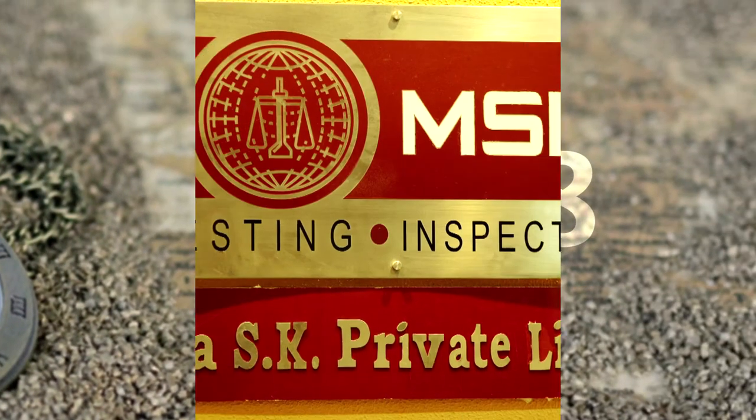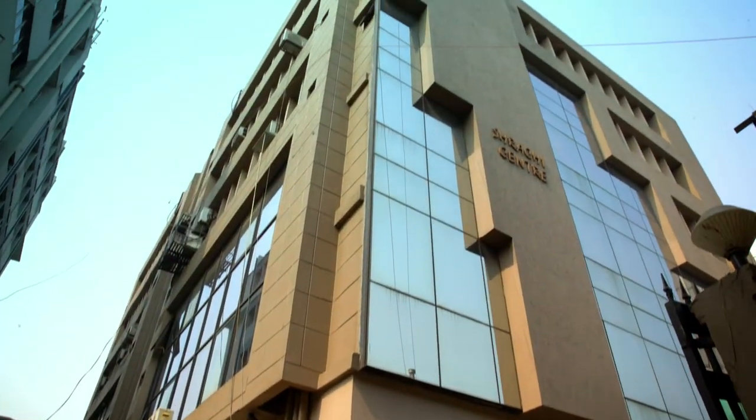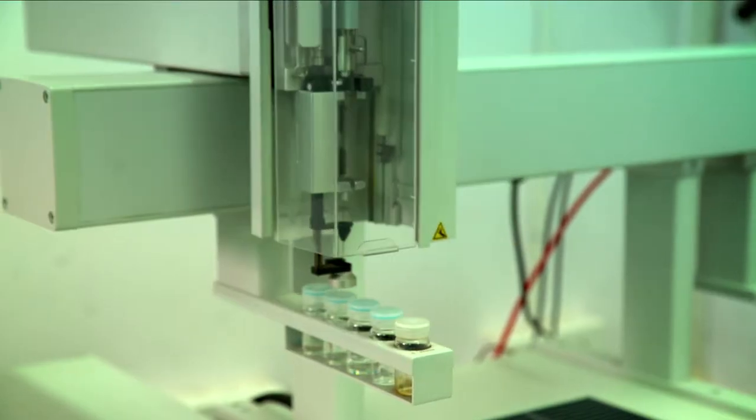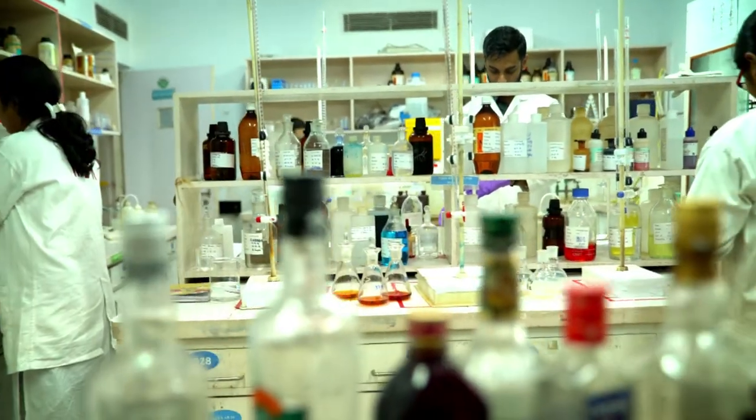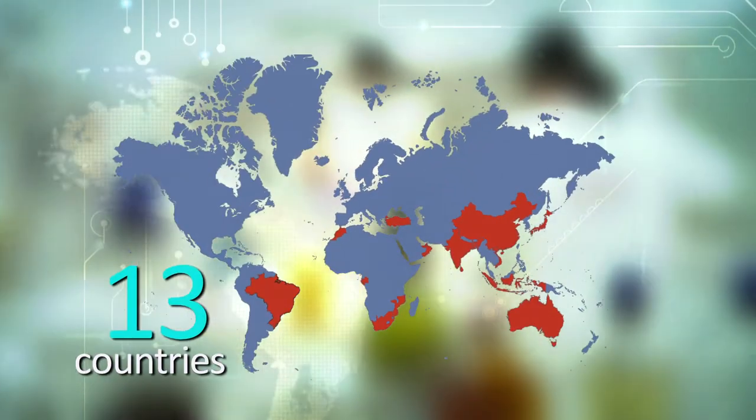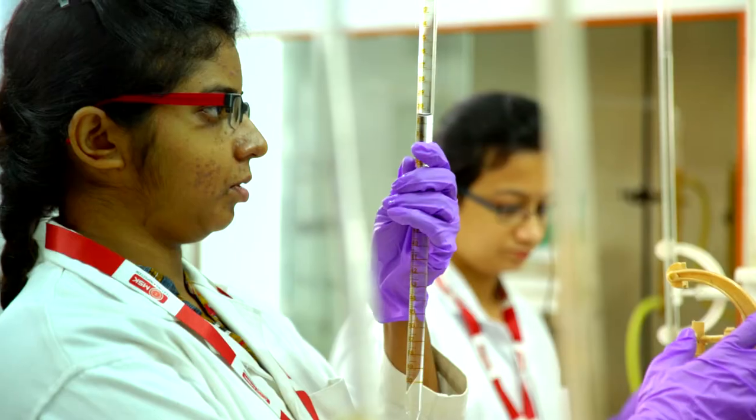Since 1938, Mitra SK, MSK, with its headquarters in India, has steadily gained worldwide recognition as an independent quality testing agency. Its international network of laboratories and offices in 13 countries work to provide accurate and consistent results always.